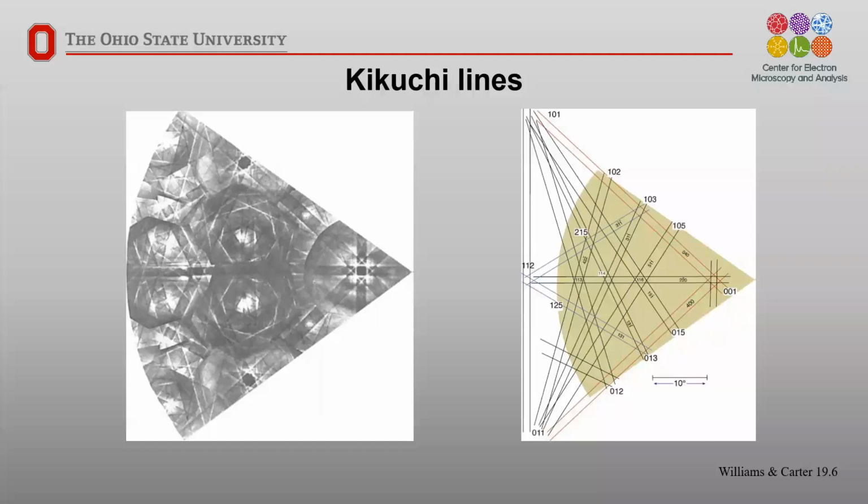So we were here, I guess this was a threefold down here, but you can follow these lines from one crystallographic zone to another and know exactly what you're looking at. So people have done the maps here and you can see these markings. If you've done SEM, the EBSD pattern that you see in SEM is exactly the same as this. And the technique now known as EBSD for a while also had the name EBKD, electron beam Kikuchi diffraction, as people from TEM tried to impose their names on the SEM people who had none of it.